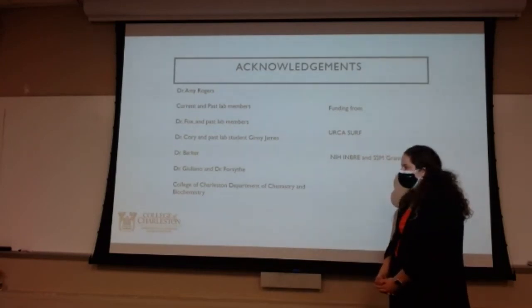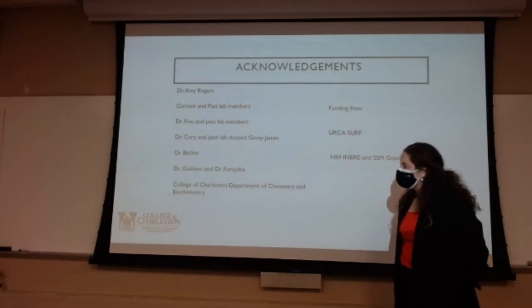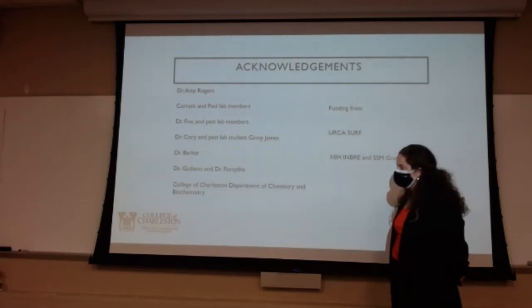Gotcha. Scott, can I ask a question about the mutant proteins? Yes. So there were 4 targeted mutations or 3 targeted mutations? 3 targeted. Exactly. So based on those point mutations, and what we know about this enzyme or other similar enzymes, what do you think the impact of those mutations is going to be on the reaction rate?